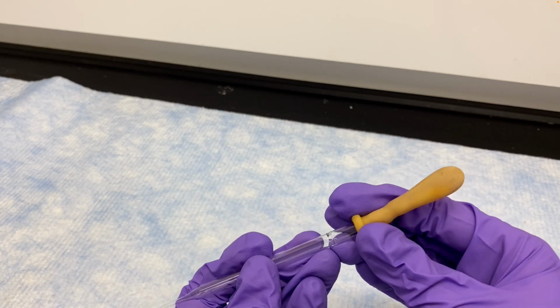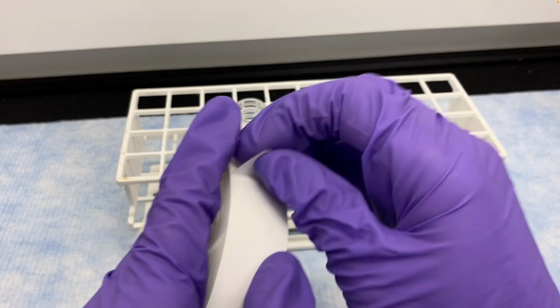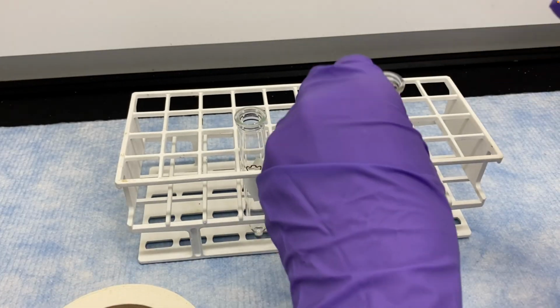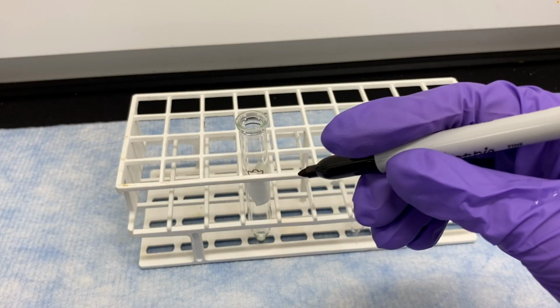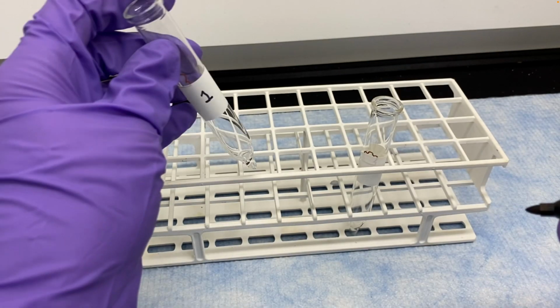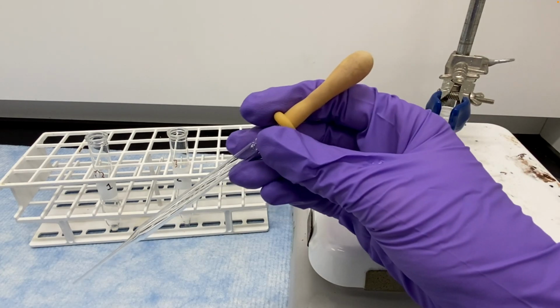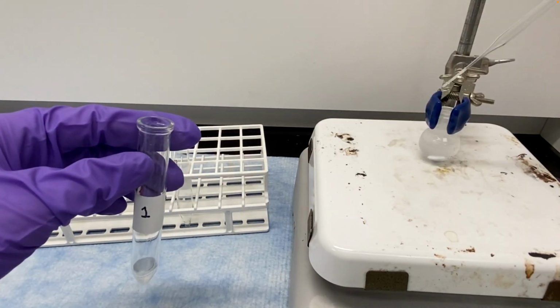So we're going to have to transfer our solution into a centrifuge tube. We're going to use 2 of them, and so you want to label them. These centrifuge tubes are a lot like test tubes, but the difference is that the very bottom of them is pointed, and that's important for this extraction we're going to do, as you'll see. So we're going to take our pipette and pipette the reaction mixture into the centrifuge tube labeled 1.